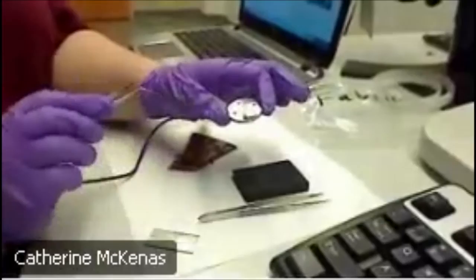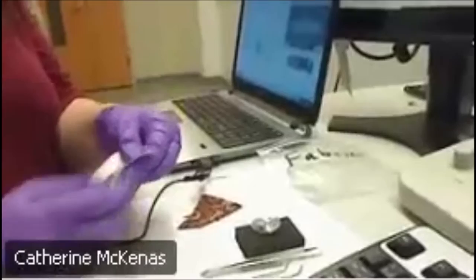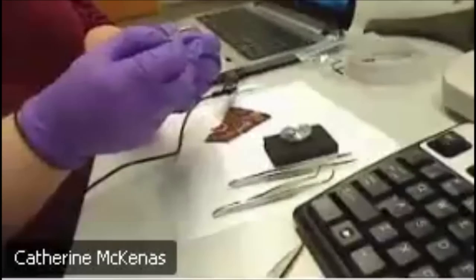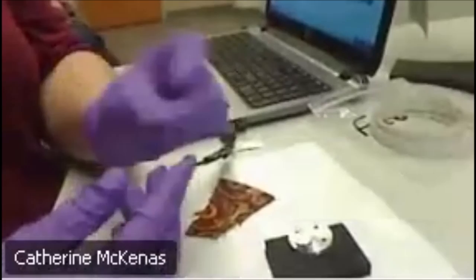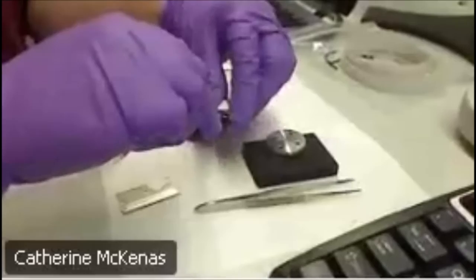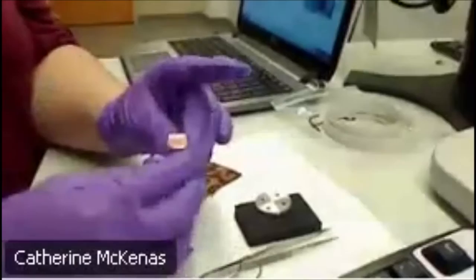What I also have here is something called copper tape, which we use to adhere all of your samples. That helps them stick onto the stage so they don't go flying around while we're trying to look at them. I'm just going to cut a piece of that off, and then we use a razor blade to help us get the backing off of this tape. Now you can see I have one sticky side, and the other side is also sticky, but I haven't removed that backing yet. I'm going to put the sticky side down on this stage, like so, and then using the razor blade, take that other piece of backing off. There we go. Now I have a nice sticky side of that stage to put my sample on.